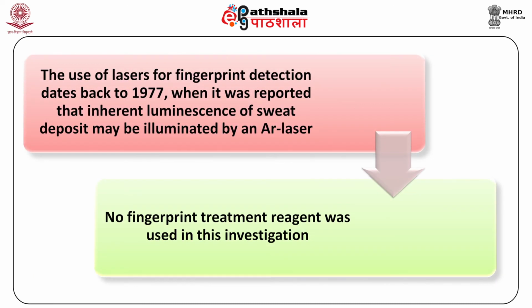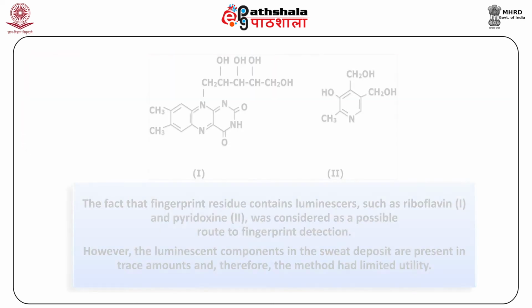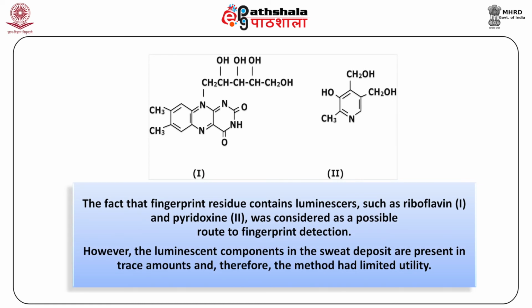The use of lasers for fingerprint detection dates back to 1977, when it was reported that inherent luminescence of sweat deposit may be illuminated by an argon laser. No fingerprint treatment reagent was used in this investigation. The fact that fingerprint residue contains luminescers such as riboflavin and pyridoxine was considered as a possible route to fingerprint detection.